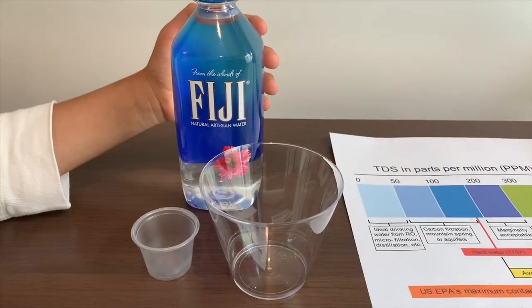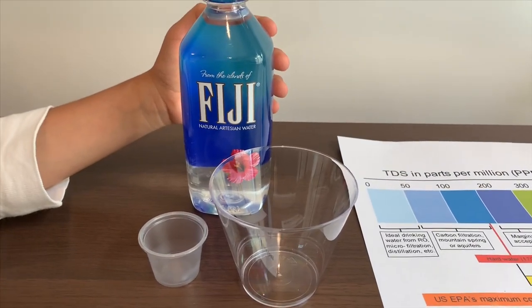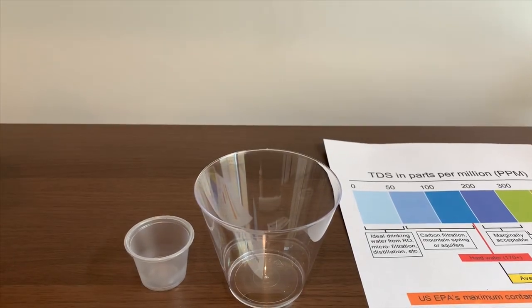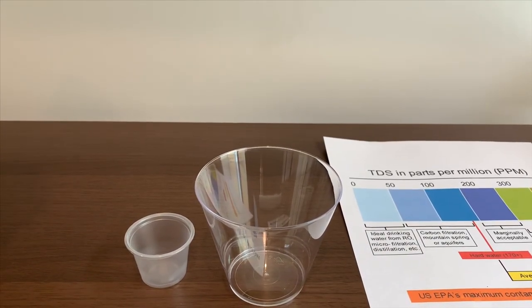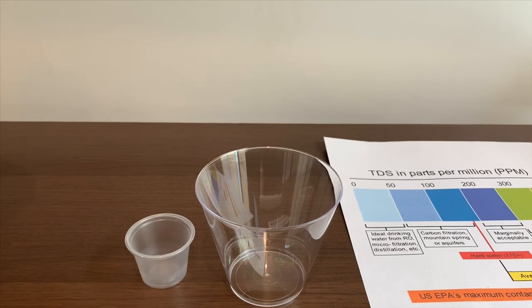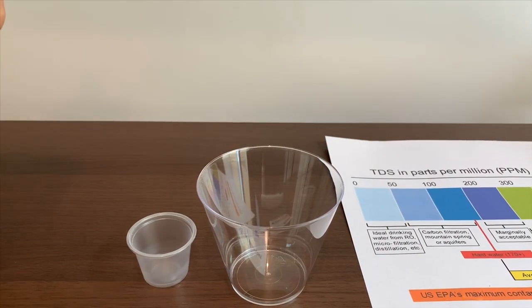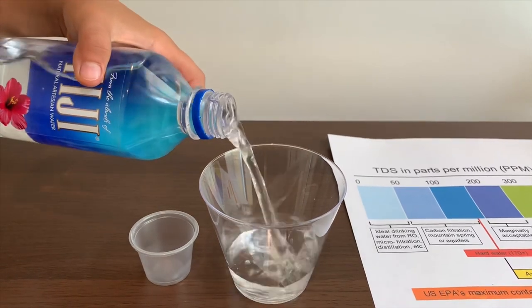This is Fiji Natural Artesian Water. It's from Fiji and it costs $1.49. Let's pour some in to see the TDS and pH levels. First, we're going to test the TDS, then we'll test the pH.